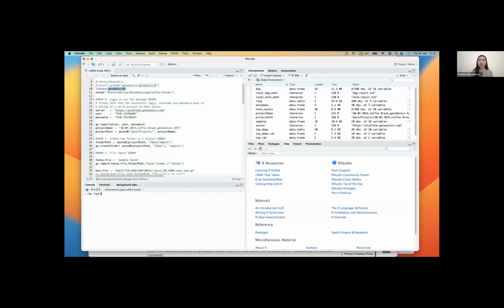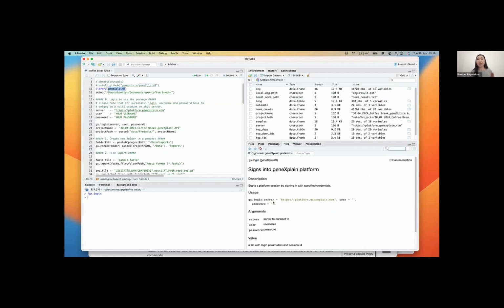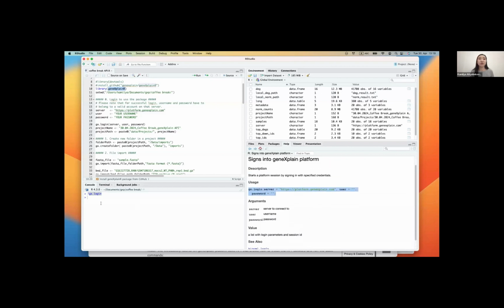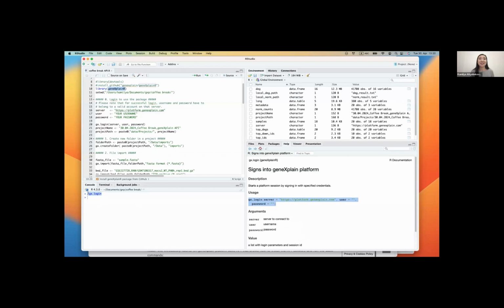And as I said, we have documentation. If you are stuck at some point, you can access the documentation using the standard R command: a question mark first, and then the name of the command you want to use. If you're using RStudio, this will also work in console mode in R. You will get some documentation, some help with the command. So be free to use this tip to see what you need to do.